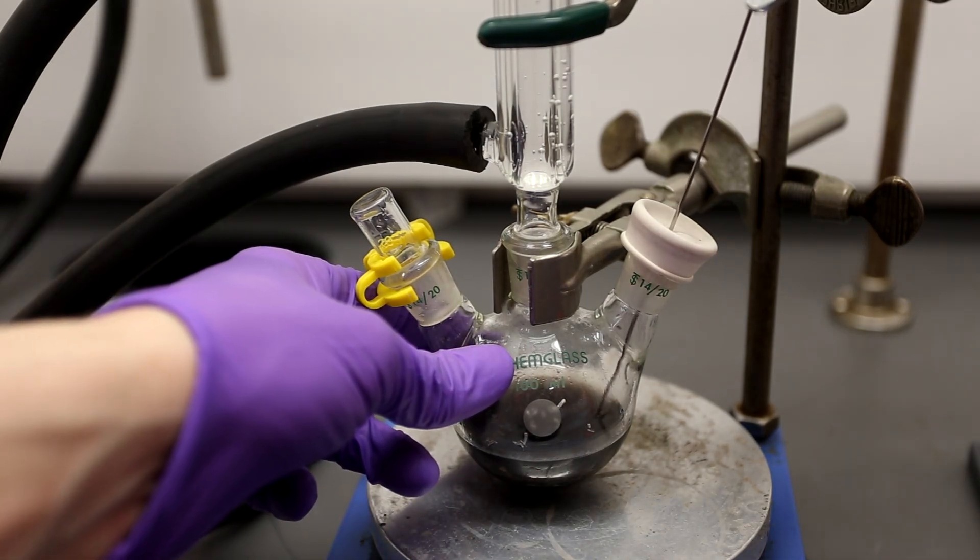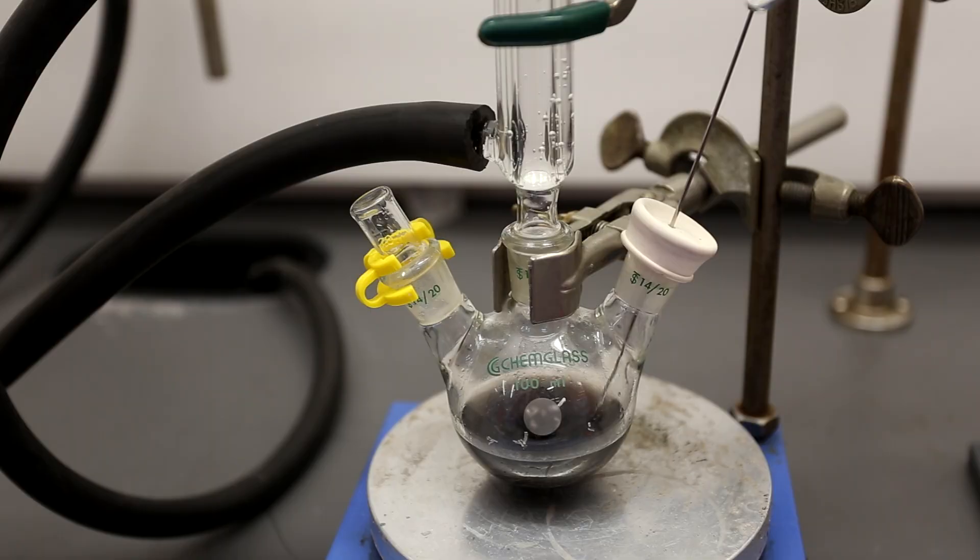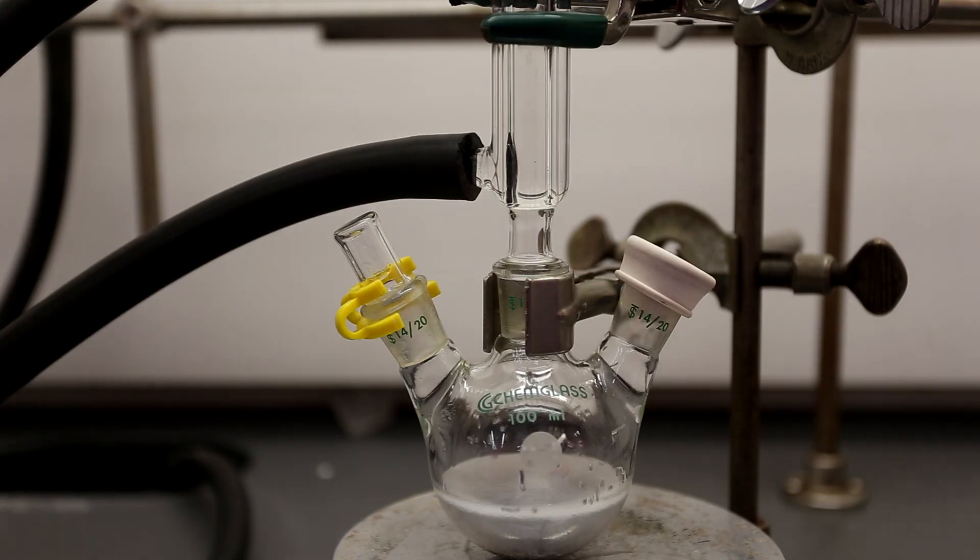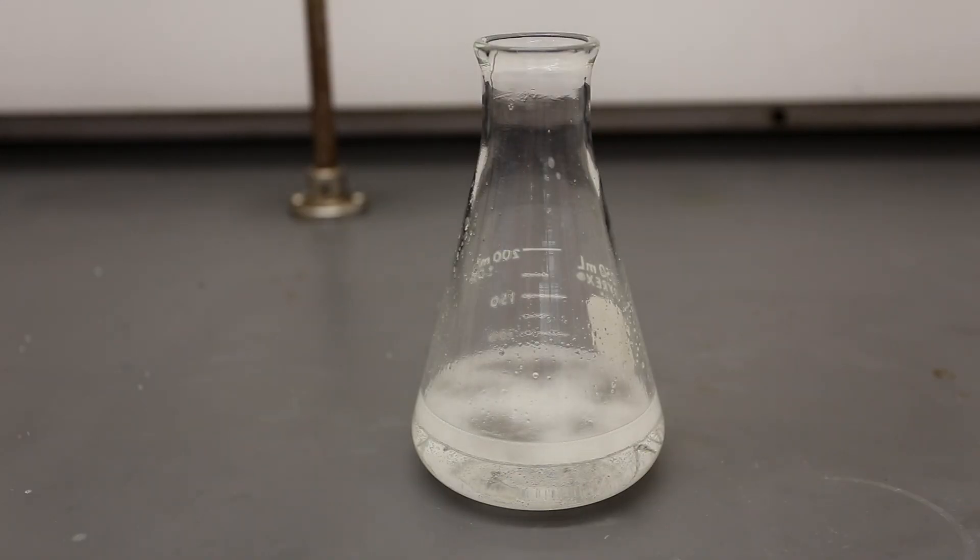The Grignard reaction is quite a useful reaction for forming new carbon-carbon bonds. The one major downside to the Grignard reaction is its incredible sensitivity to water. Presence of even a small amount of water is capable of ruining the reaction.